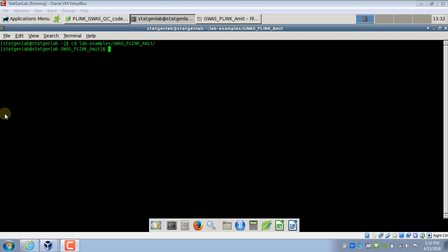In this video, we are going to focus on the first part of GWAS setup, which is how to read data, how to clean data, and how to perform quality control.